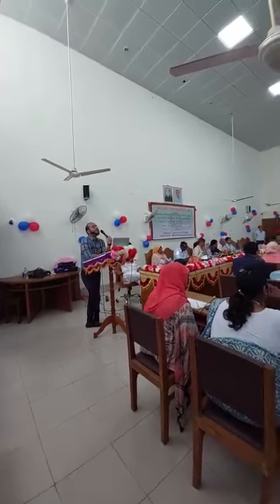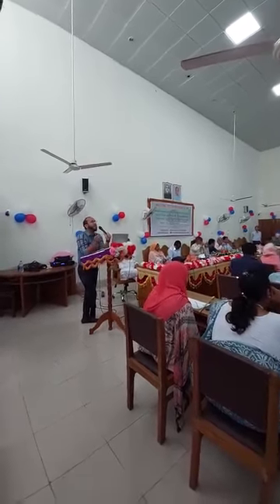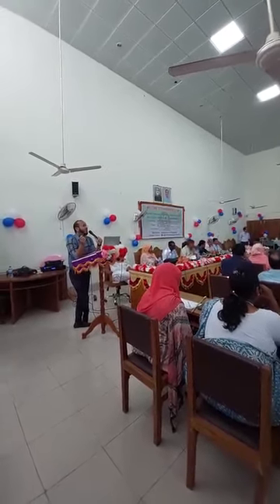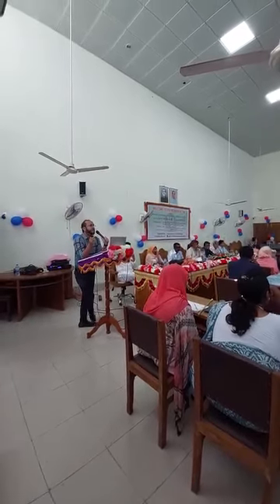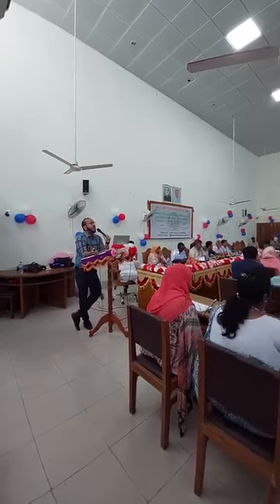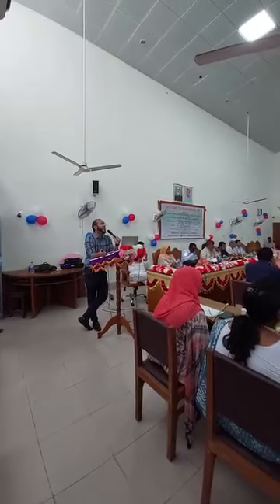So exfoliative cytology includes pleural and peritoneal fluid cytology, sputum, urine, bronchial wash, and gastric wash. There is also abrasion cytology, like bronchial brush and bronchial lavage, a very popular technique among respiratory specialists. Another one is a special cytology technique known as imprint cytology. Where frozen section is available, we do imprint cytology as well.